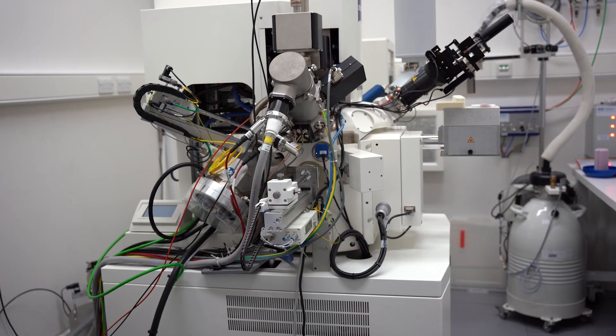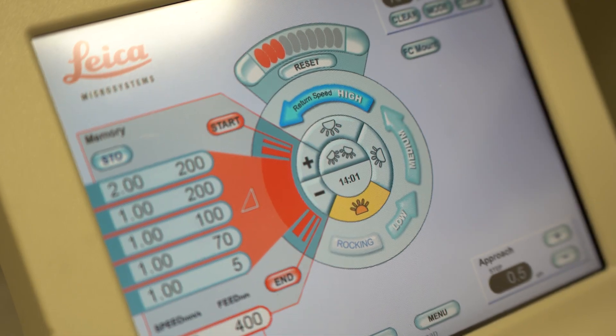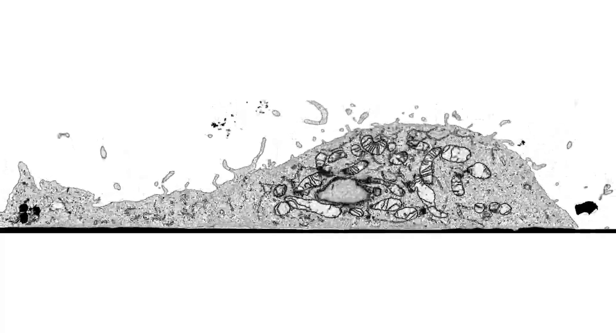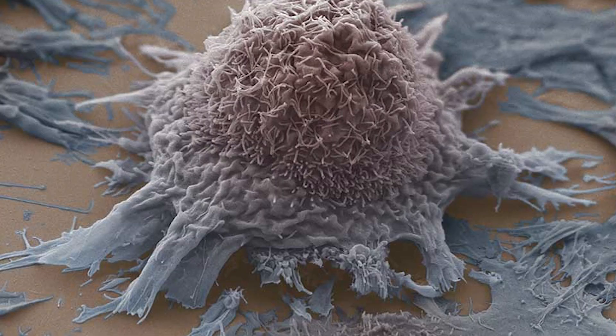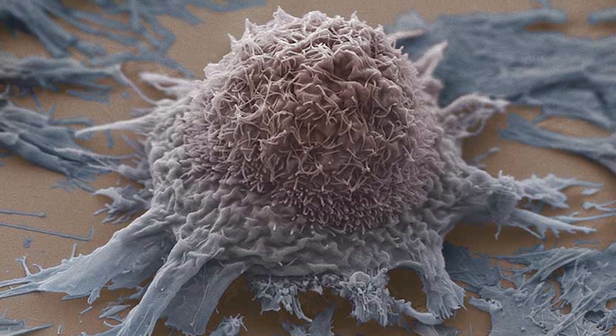We now have microscopes here that run automatically for several months and can generate terabytes of data. There are more than a hundred labs at the Crick and we work with around sixty of them every year on around a hundred different projects. Every time we look down the microscope we're discovering something new, and they're incredibly beautiful. It's just a whole different world — a picture speaks a thousand words, as they say.